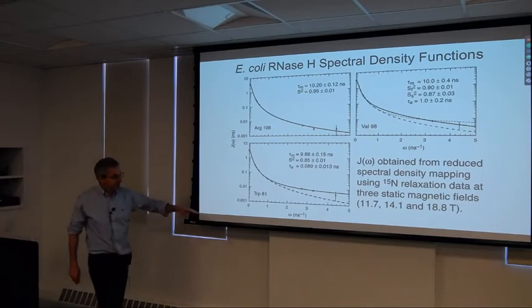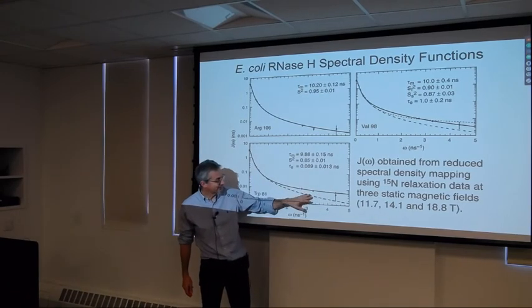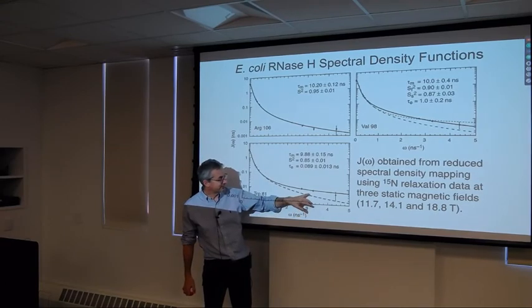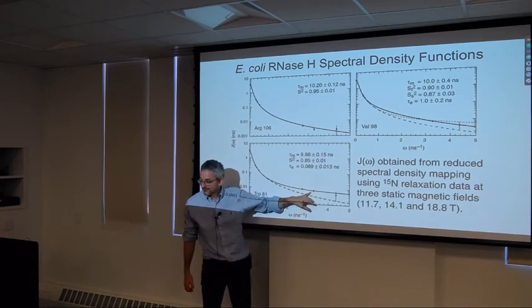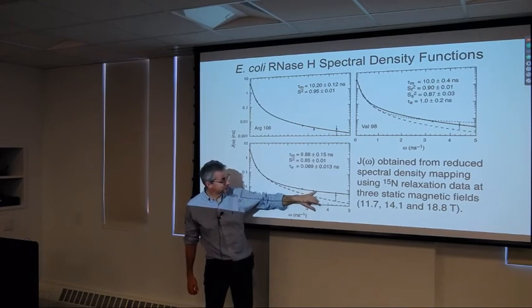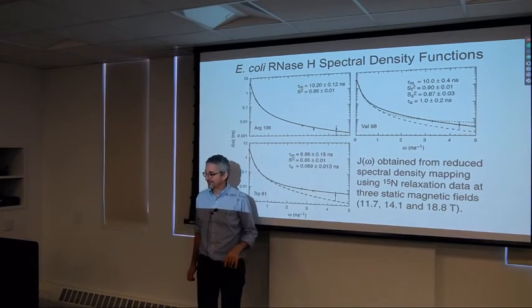But out here, this is where the proton Larmor frequencies are. The proton single quantum frequency, the double quantum and zero quantum frequency differ by only plus or minus 10%. So it's usual in these experiments to replace those three values by a single average value.